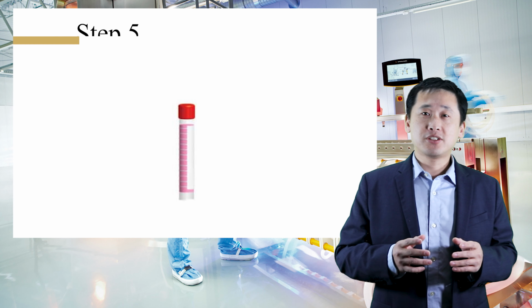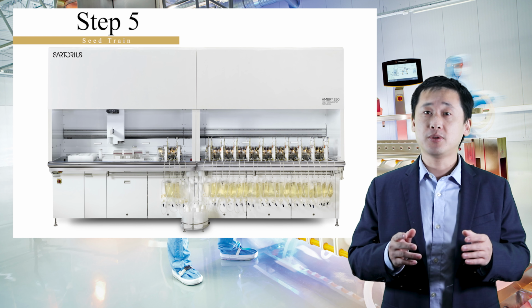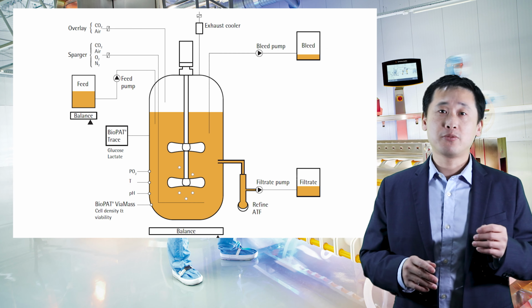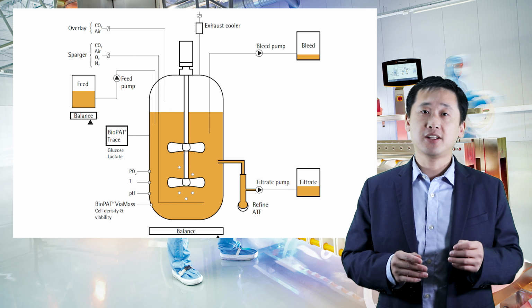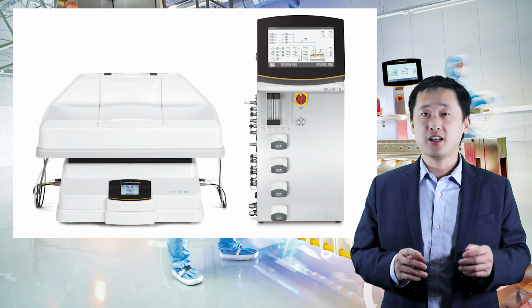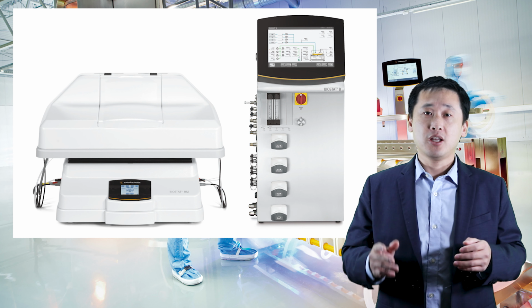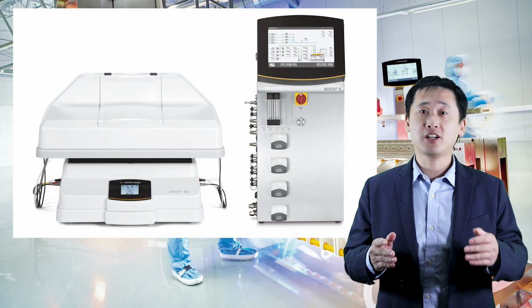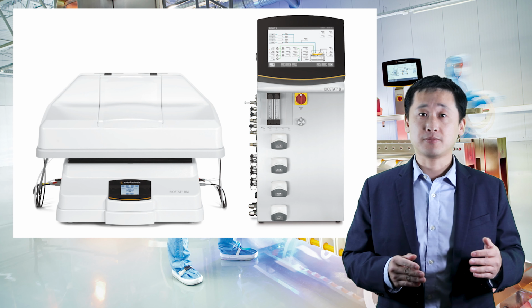So as we start with our cell seed, we can rapidly expand the cell line with the Ambr 250 high throughput perfusion system to automate the whole liquid handling system in the 250 ml reactors. With the perfusion setup, which enables media exchange in a bioreactor, we can achieve high cell density, which can reduce several expansion steps. Now, after completing expansion on a 250 ml scale, we can transfer the reactants to a 2-liter flex bag with a 1-liter max working volume. And once viable cell density has been achieved on the 2-liter scale, we can transfer the culture to a 20-liter flex bag to continue the cell expansion.